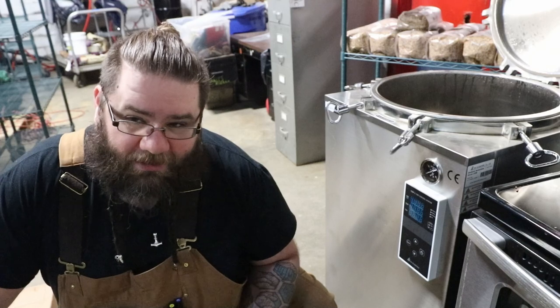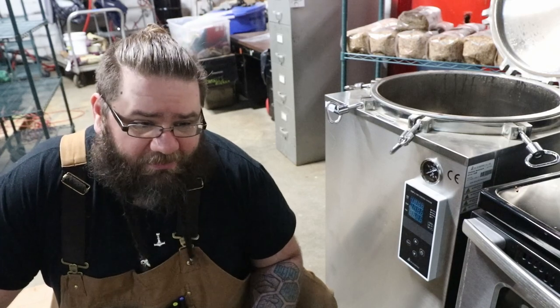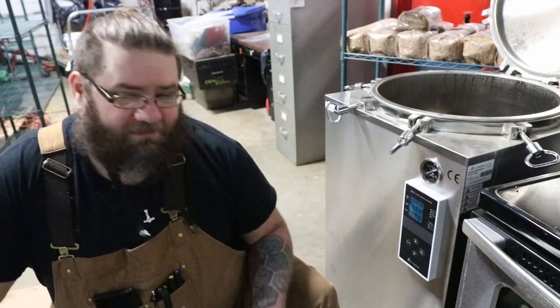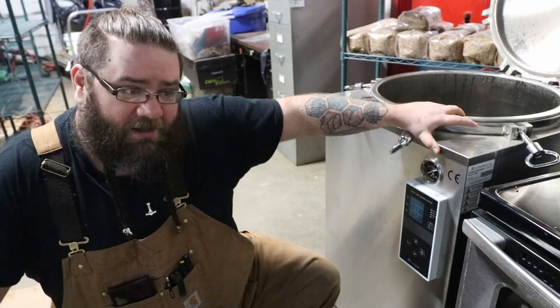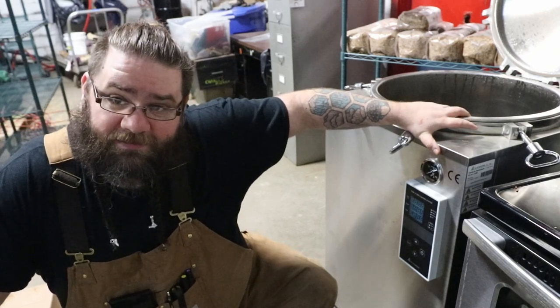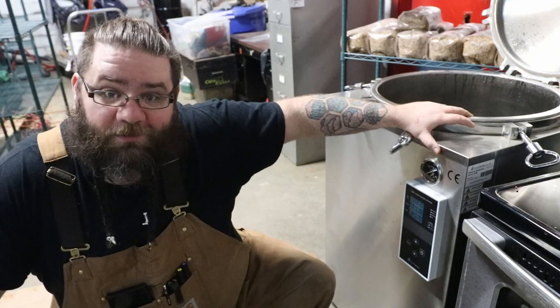My slants, like I said, I'll show you how I do those in all my units later, but I do wrap those up in a unicorn bag. But my success rate's maybe like 20%, and that's just not acceptable for me. The All-Americans are much better on that. So this bleeds off pressure kind of in a similar way that the pressure canners do. It just does a lot better job of sterilizing and sterilizing quickly. With that, let's go talk pressure canners.